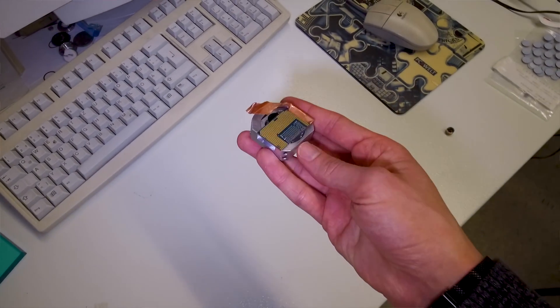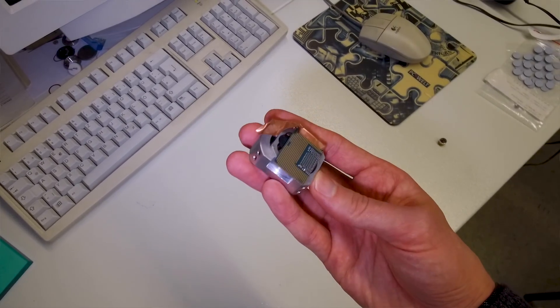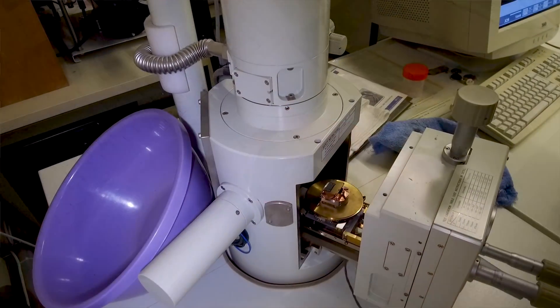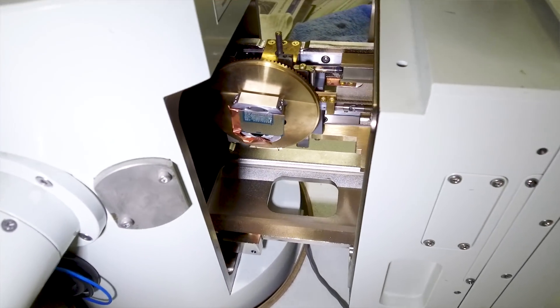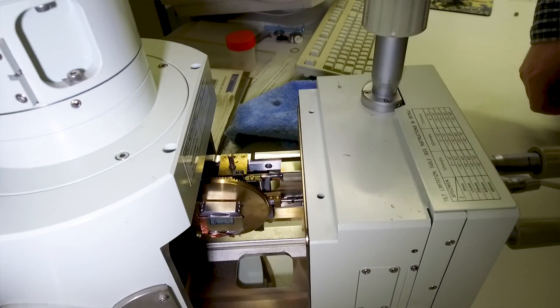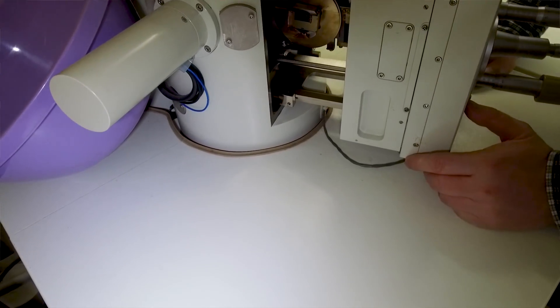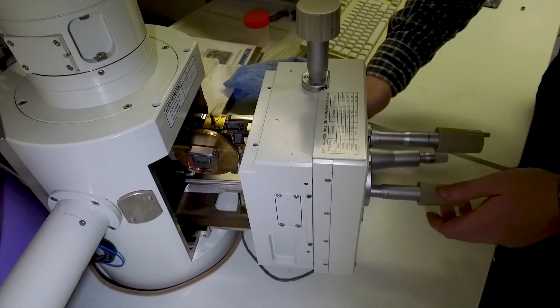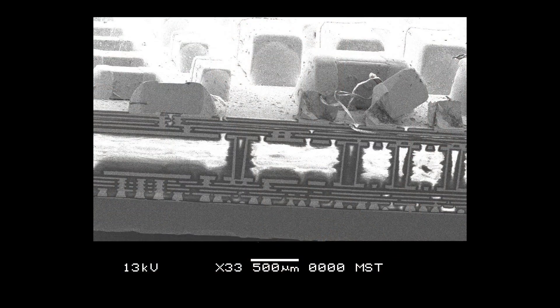We still have to connect the CPU to the scanning electron microscope, and that's why we have copper tape on here — we just put the copper tape onto the CPU and then place it inside the SEM. Then we close the SEM and build up a vacuum inside, which is needed because all the particles in the air — not just dust but the air molecules themselves — would block the electron beam. That's why we need ultra-high vacuum inside the SEM. Once we did all that, we can take pictures of the CPU.